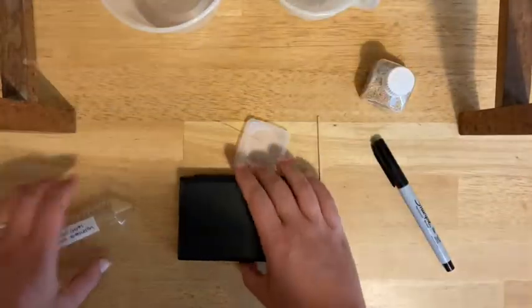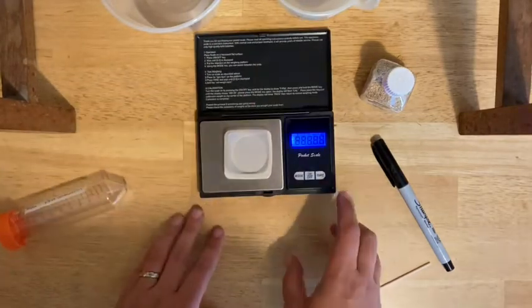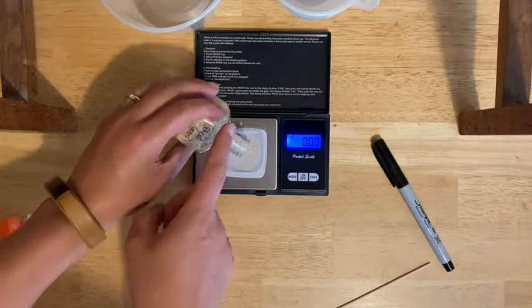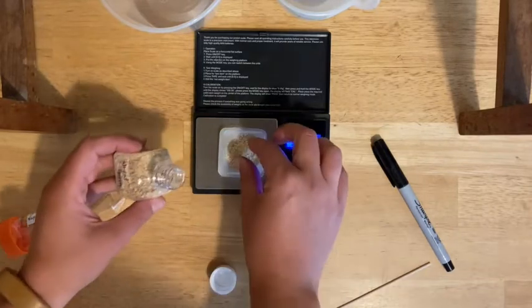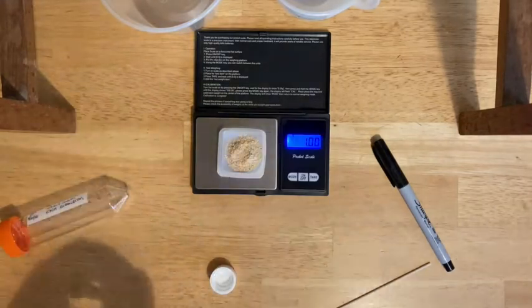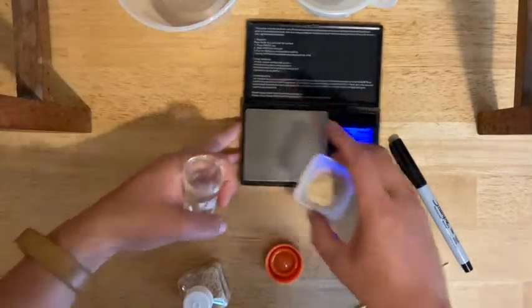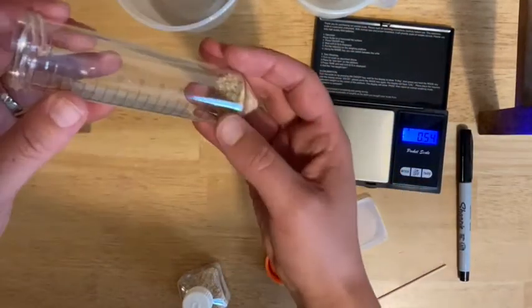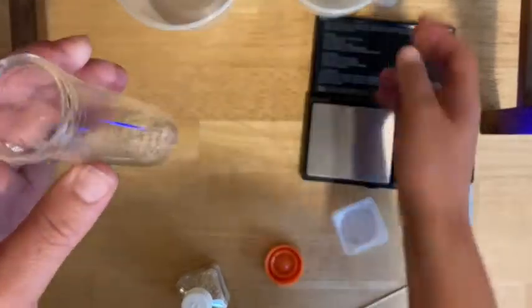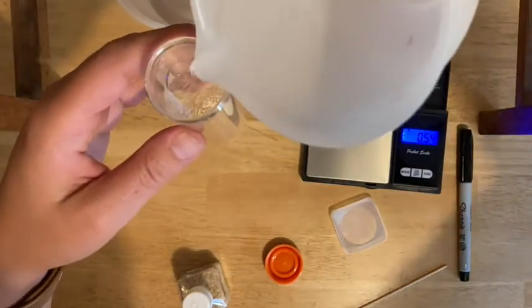Then you're going to weigh out one gram of wheat germ. If you go a little over, you can take a little bit off until you get to the right amount. You then want to take the wheat germ and put it into your labeled tube — try not to spill. You're going to fill up to the 20 mL line on your tube with just plain water. Pour carefully at eye level so you make sure you get right to that line.